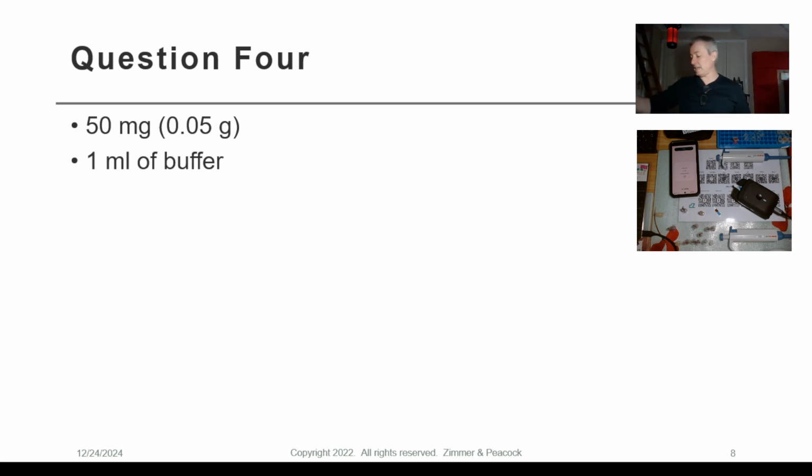But I wouldn't call this a coffee sensor, and I wouldn't call this a tea sensor. This is a caffeine sensor that we're using in those matrices. But in order to prepare the sample, it's not brew the tea and then take a bit of the tea and put it into the buffer. It's actually weigh out the tea leaves.